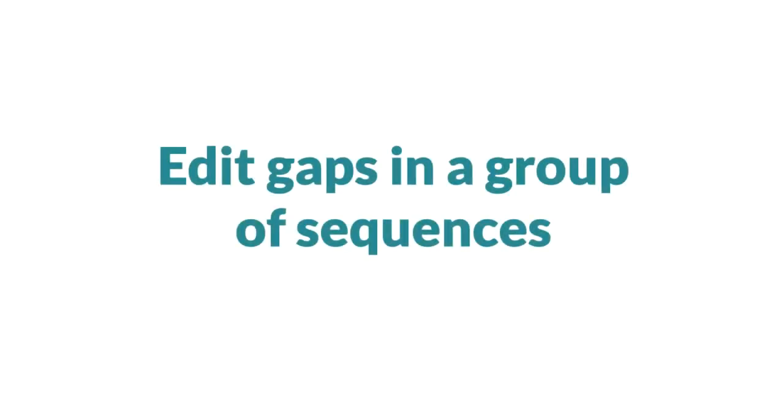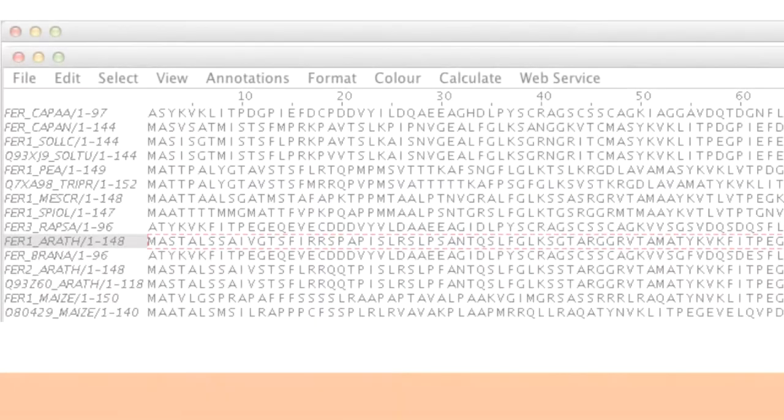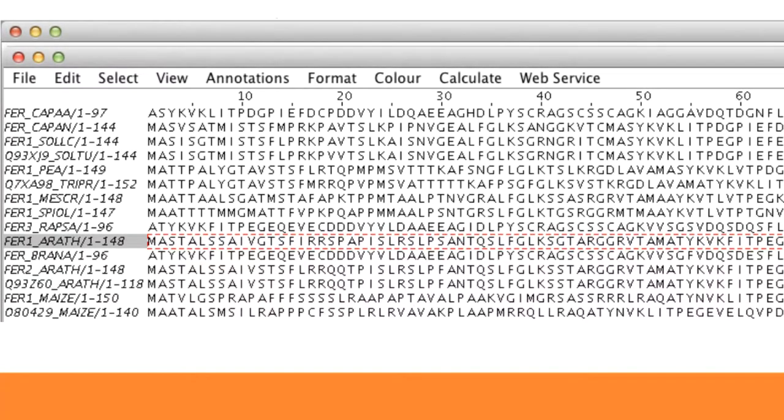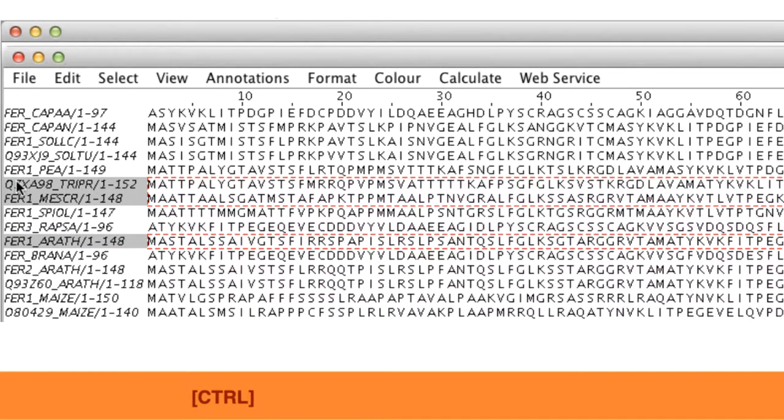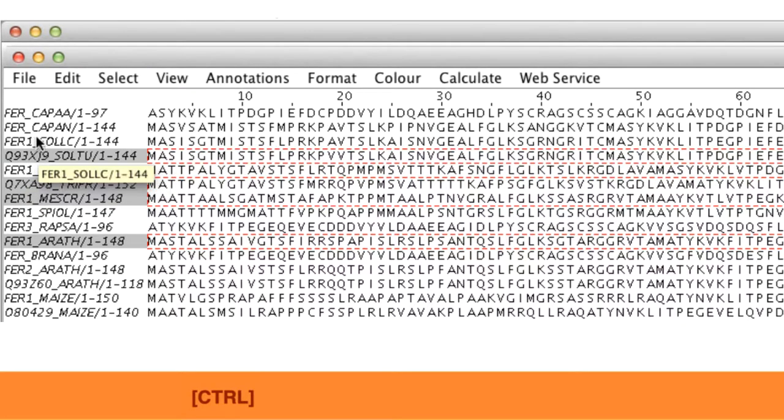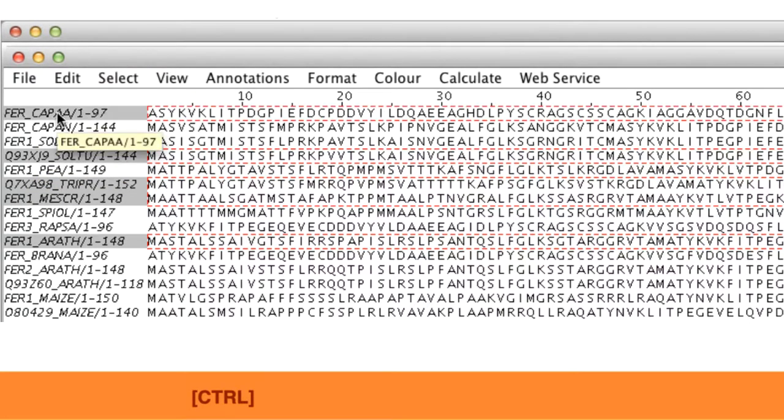To insert gaps into a group of sequences, first I select the group by going to the Sequence ID panel, holding down the CTRL key whilst I use the mouse to select the sequences of interest.